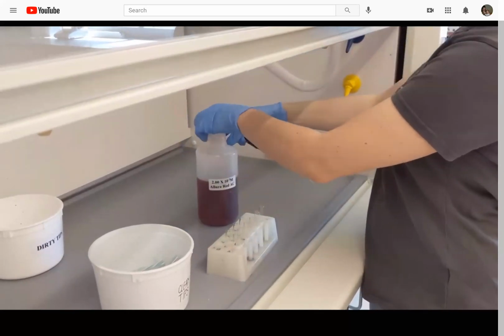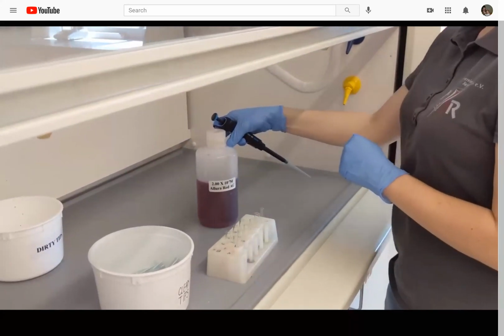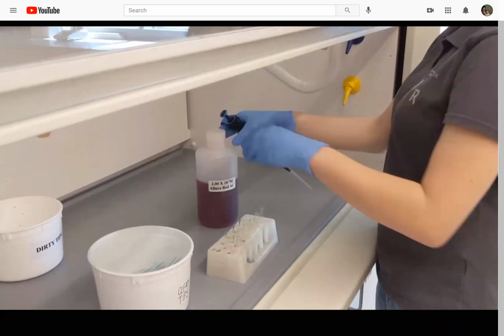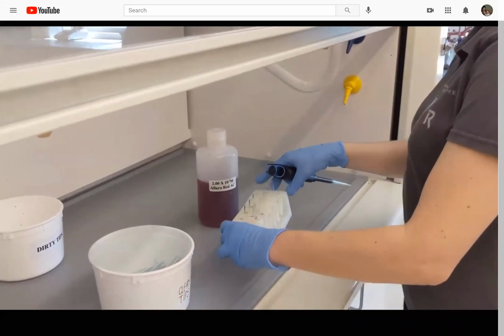You want to make sure that you write down the starting concentration so that when you do your dilution calculations, you know what concentration to start with. And that's always going to be written on your reagent bottle.